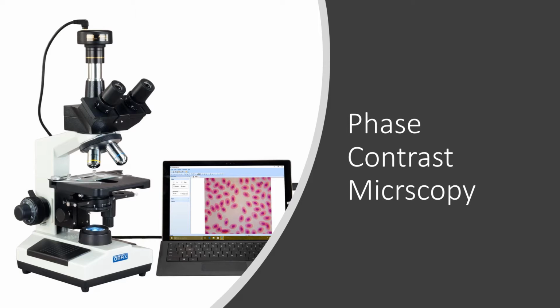So last time we talked about dark field microscopy, and before that we talked about bright field microscopy. This time we're going to talk about phase contrast microscopy. So let's get started. But wait, before getting into phase contrast microscopy, let's see how the microscopes look.